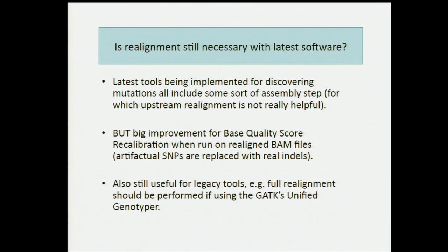However, the next part of this talk is about these base quality scores, which Ryan will talk about. We talked about the confidences per base coming out of the aligners. Well, those are not accurate, and you have to make them accurate. Ryan, I'm making a note now, you will describe why in your presentation. If you haven't done realignment, at least at 99.5% of your sites, at these known sites, you will harm those results. You will get worse results. So if Ryan has not covered this, raise your hand and say, Ryan, tell us why you need to do realignment.